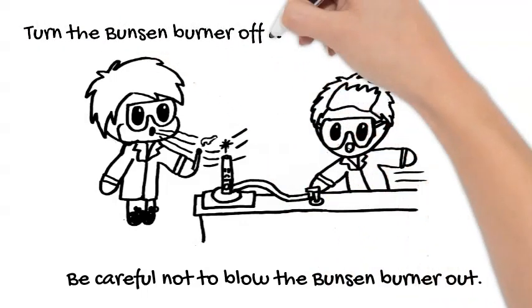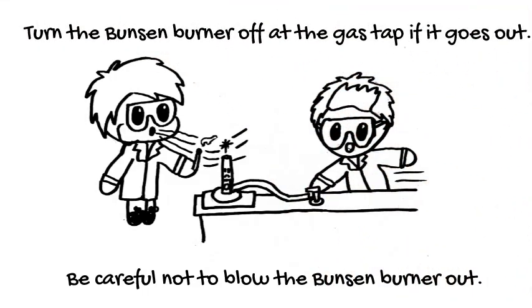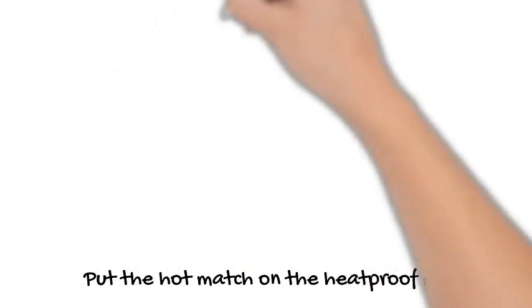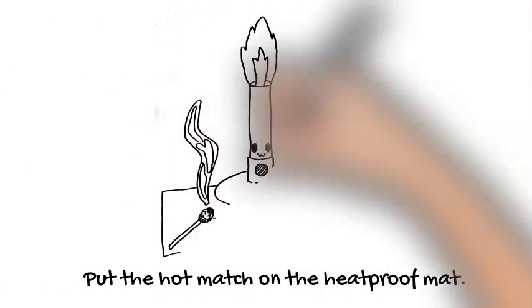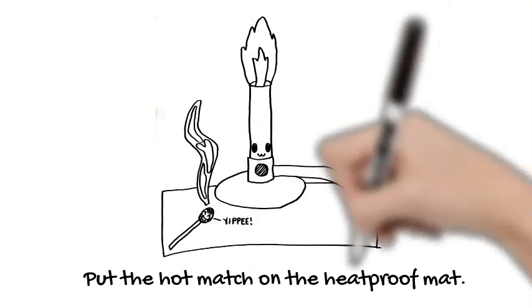If the Bunsen burner does go out for any reason, turn off the gas tap immediately. When you've put out your match, put it on the heatproof mat under your Bunsen burner. Don't put it on the bench or straight into the bin.